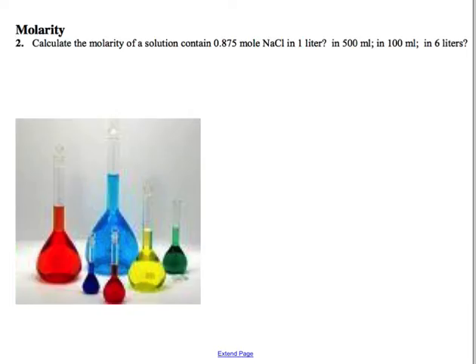They're ranging from this incredibly adorable 10 ml flask. It's the cutest thing I've ever seen in my life. I kind of want to make earrings out of it. It's so cute. Then we've got the 50 ml, we've got a 100 ml, a 250, a 500 ml, and then we have a liter flask, and then 2 liters.